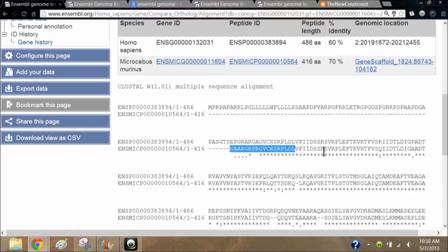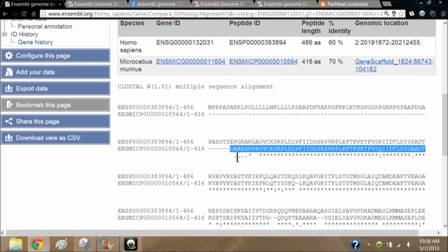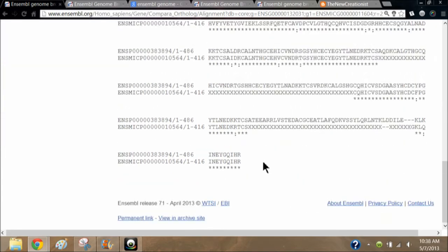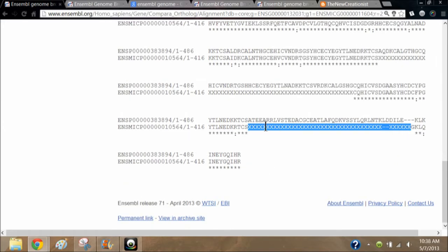Of what is in mouse lemur and human together — indicated by the asterisks below the aligned sequence — 70% is going to be identical. The dots mean there's a substitution: in human you have a different amino acid than in mouse lemur, while the asterisk means it's the same. Down here you also have another stretch where part of the amino acid sequence is in human but not in mouse lemur.